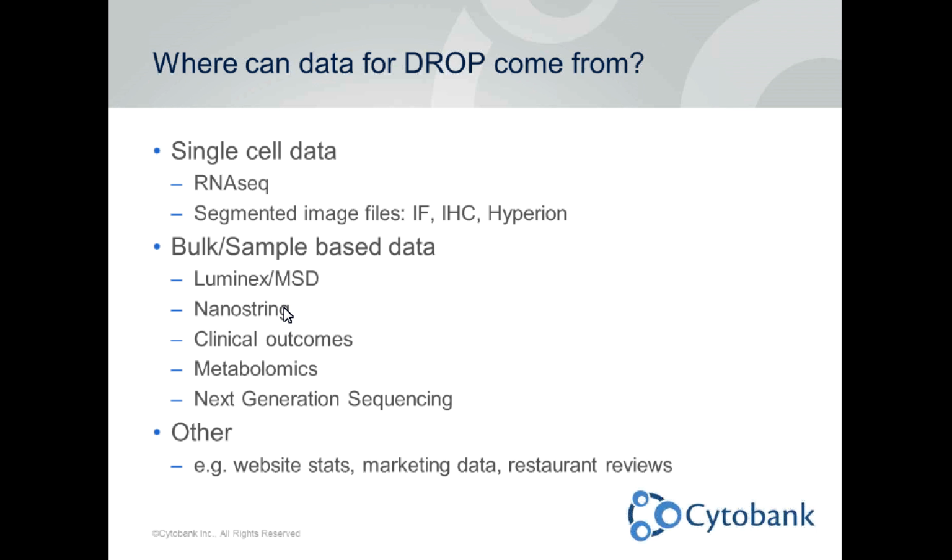But then if you want to get really creative, you can put in non-science data. So if you wanted to look at website stats or marketing data, or if you go on Yelp and pull some data down and look at restaurant reviews, all of that data, as long as it's conceptually organized, as in each row is an event and each column is a channel or an attribute, you can put that into Cytobank and then run our traditional and advanced tools on that data.